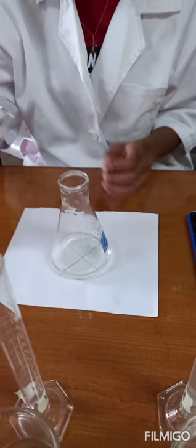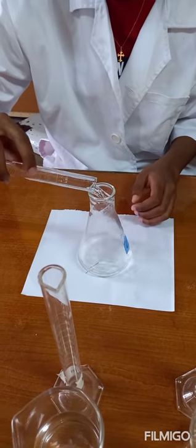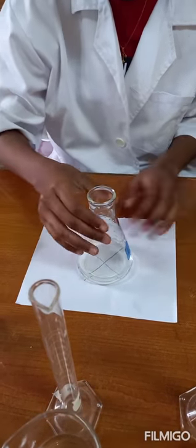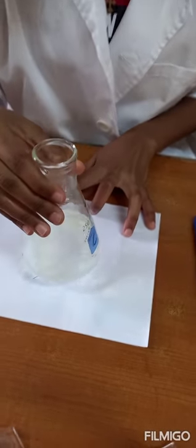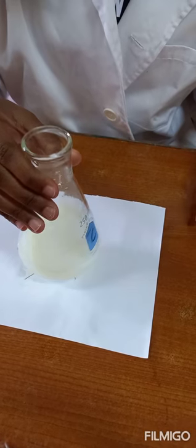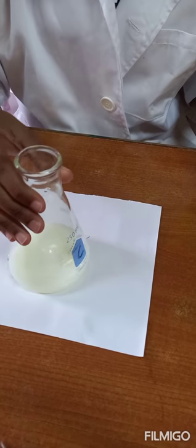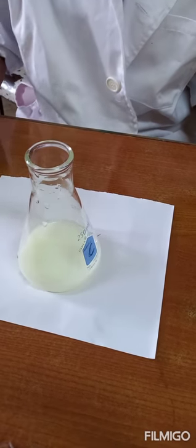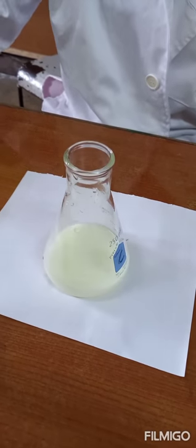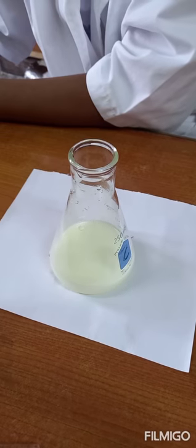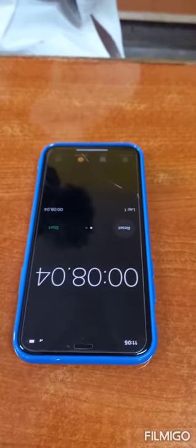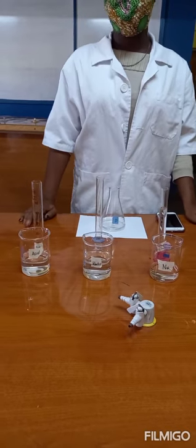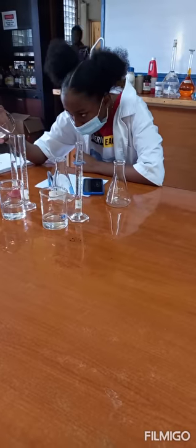Go ahead, start the timer and swirl. As you can see, the X is no longer visible through the conical flask and the time is eight seconds.